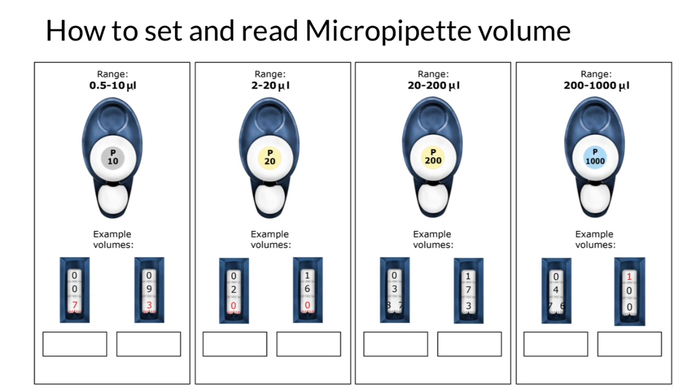Now let's check our first micropipette. So how to read what we have here? If you think that this is seven microliters, it is not so. Imagine that between black and red numbers, we put here a decimal point. So these numbers here mean 0.7 microliters.